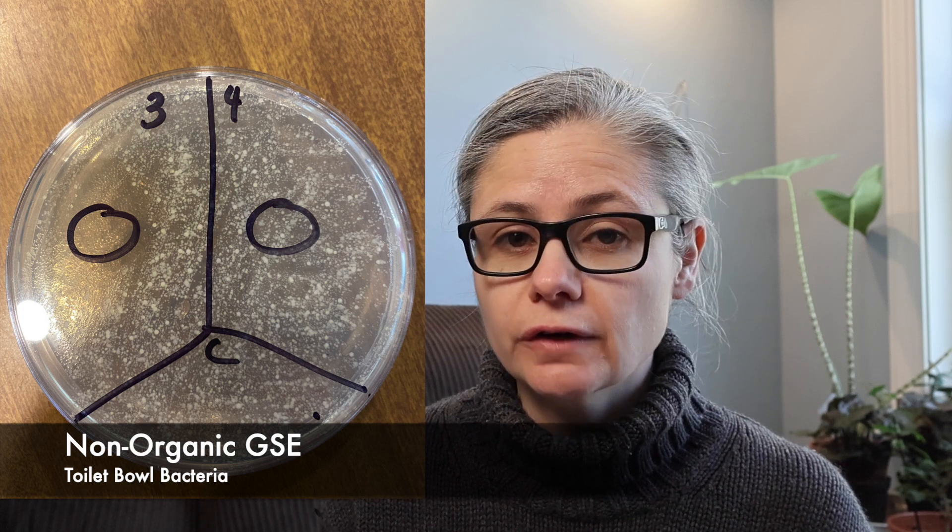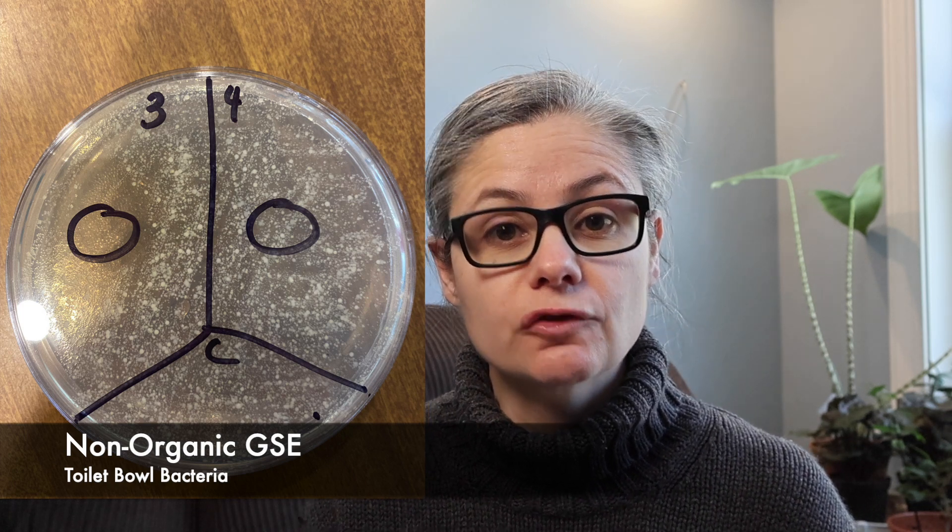Next, the non-organic grapefruit seed extract. Section three was the full-strength one drop, and we can see a huge clearing there — the full-strength grapefruit seed extract absolutely inhibited bacterial growth where we placed a drop on the petri dish. Section four was the diluted grapefruit seed extract, and I don't see any difference at all. Looking at the toilet bowl bacteria with the grapefruit seed extract, in section three full-strength we can definitely see a clearing of bacteria around where the drop was placed. In section four, the diluted grapefruit seed extract, I don't see any difference or any change at all.